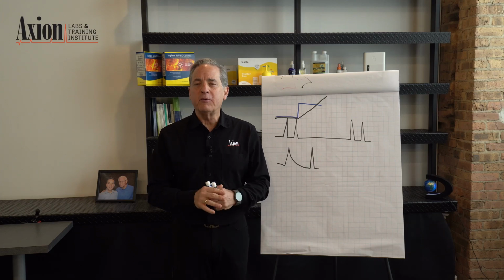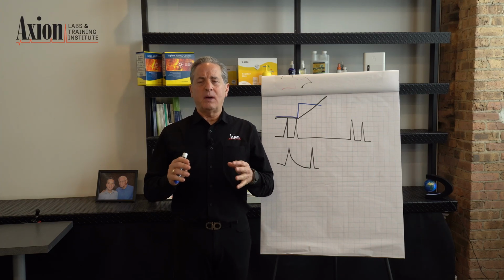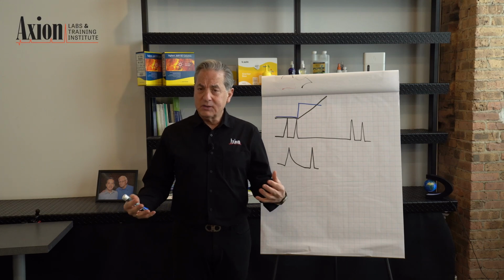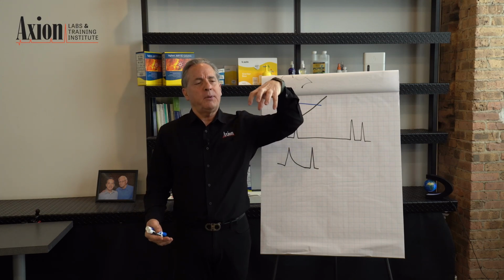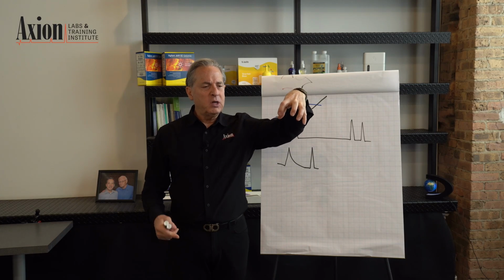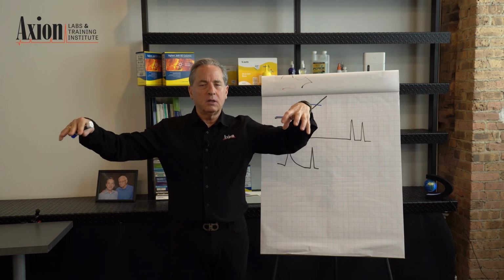So that allowed us to move to a much better system, and that is constant flow. So here's where it makes a difference. If you're doing a temperature program, if you're running constant pressure, which is the default of instruments still today, constant pressure means you're putting a pressure on the head of the column, let's say 20 psi, and you've determined that pressure gives you your favorite flow rate. You love that flow rate.